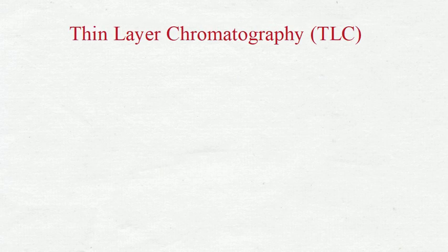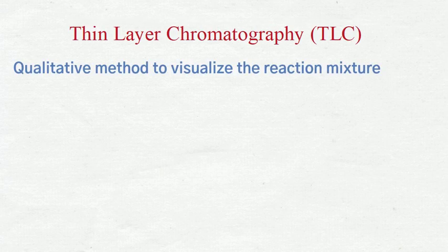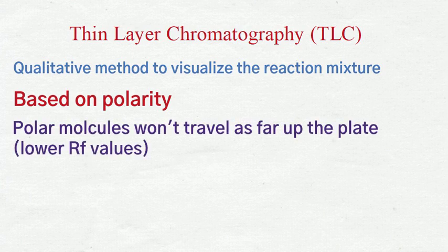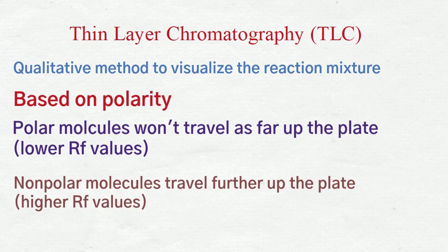So let's review quickly. TLC is a qualitative method to help us visualize what we have in our reaction mixture. It works based on polarity. Polar molecules won't travel as far up the plate, whereas non-polar molecules travel faster and move further up the plate. And this is how we can separate them.